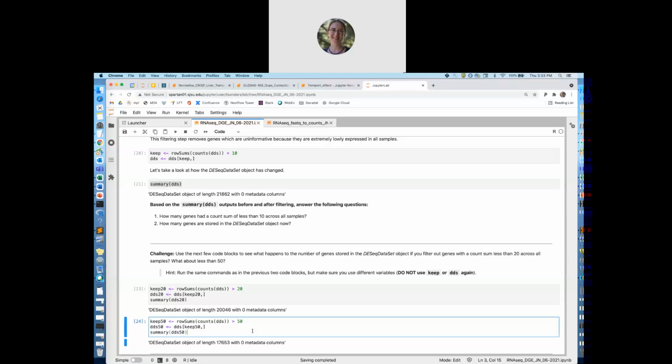However, there could be a couple of genes being filtered out that would somehow become differentially expressed because all of their row sums were in one flight or ground control group.